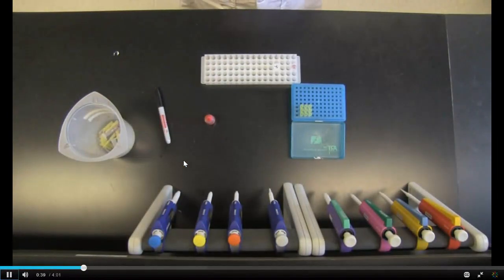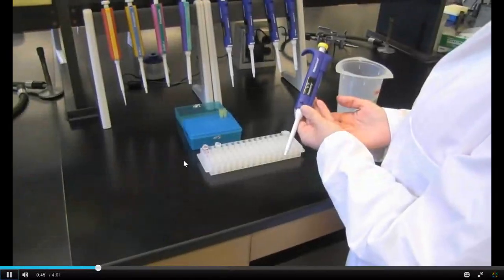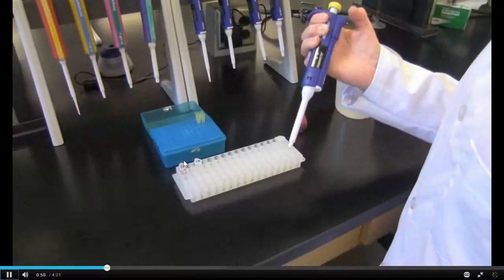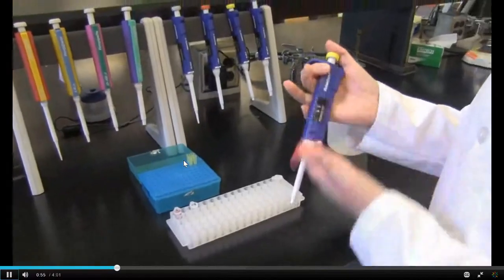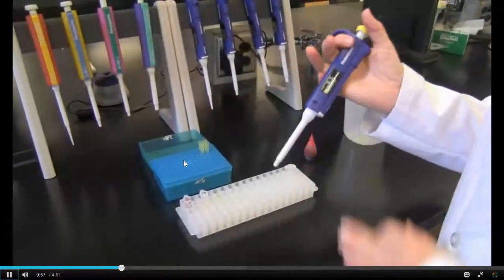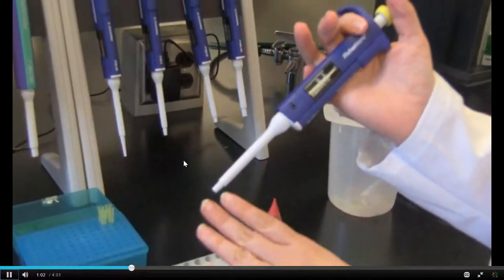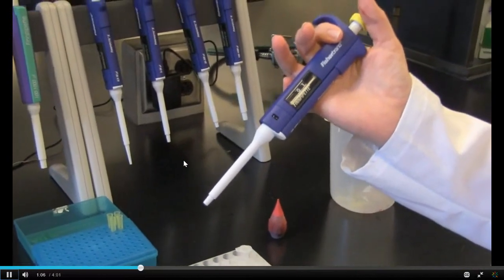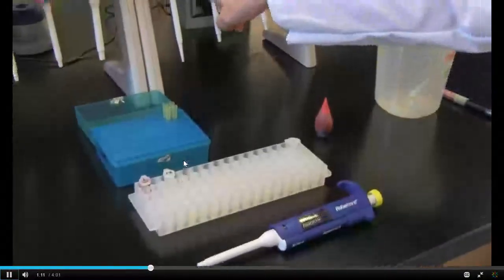The first thing we need to do in order to learn to use the micropipette is to introduce the parts. Important parts of the micropipette include the tip ejector or sidebar, the plunger for drawing up or dispensing liquid, the handle, the volume meter, which indicates the amount of volume being pipetted, and the tip holder. The first step to using a micropipette is to determine what amount of liquid you need to work with, and then choose the correct micropipette.